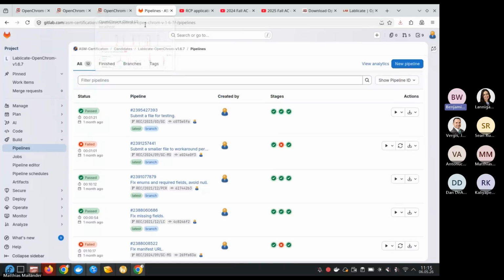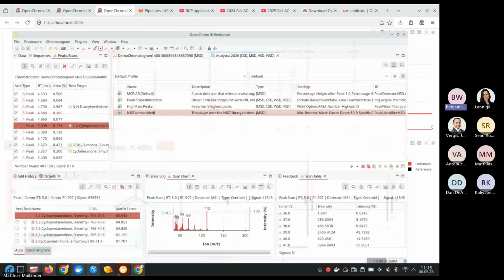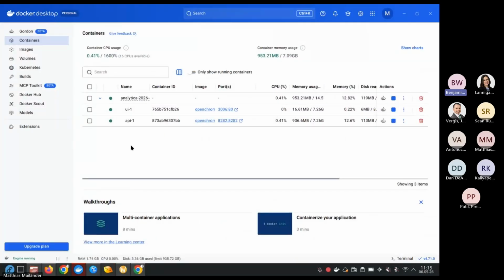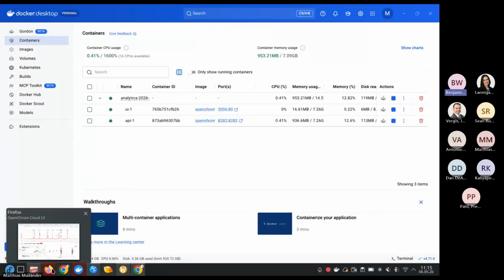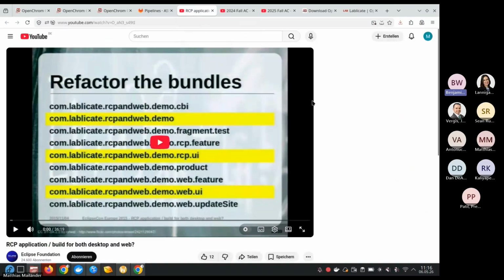So then you may also wonder, how did we squeeze this scary chromatography desktop tool, which looks a bit like an integrated development environment, into a Docker container? That seems like a project that could fail. And actually it didn't, because this was planned all along.